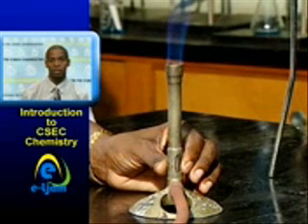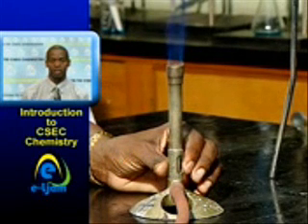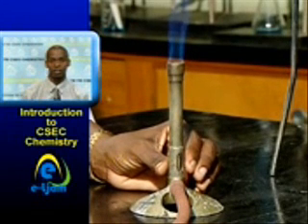The medium flame, also called the blue flame or the invisible flame, is difficult to see in a well-lit room. It is the most commonly used flame and burns at approximately 500 degrees Celsius.